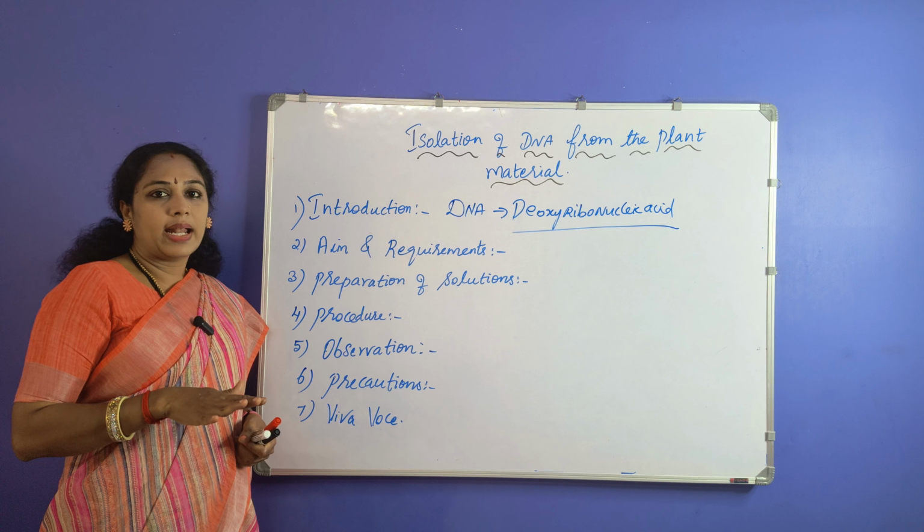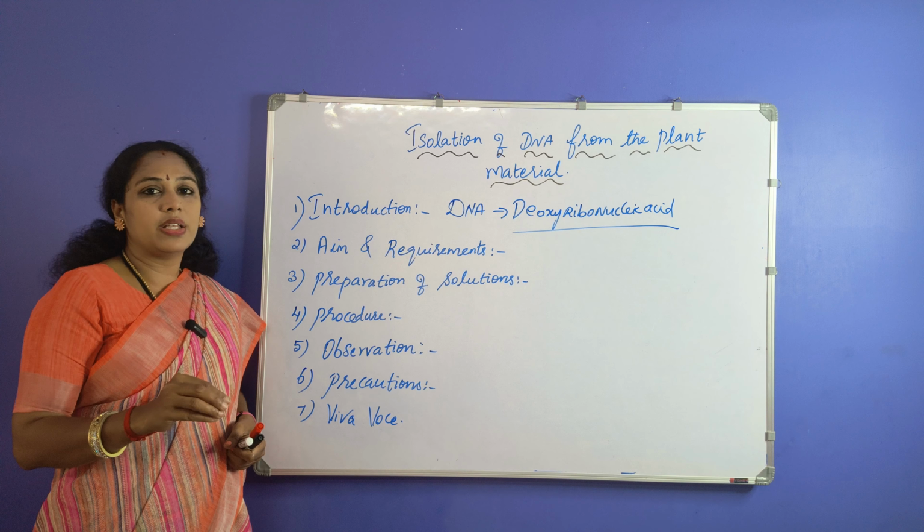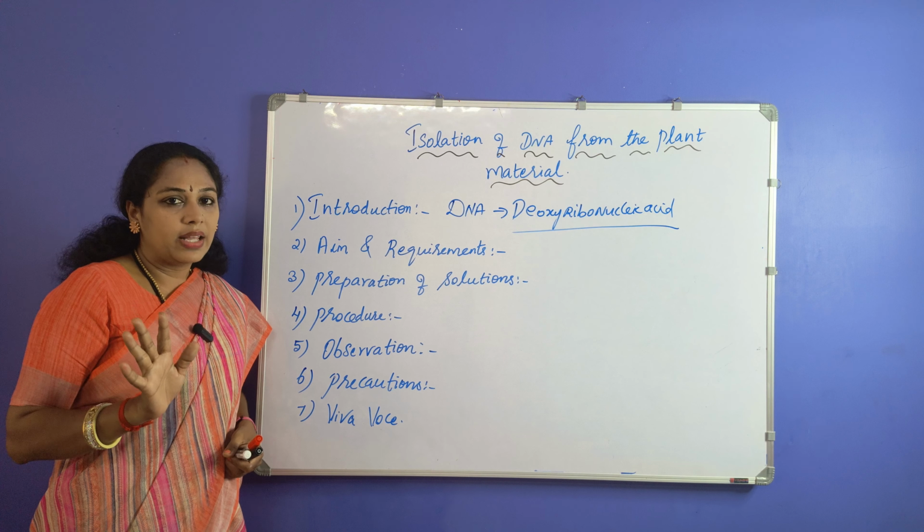Most of the living organisms have DNA as the genetic material. An exception is seen in most of the viruses, where RNA remains as the genetic material.